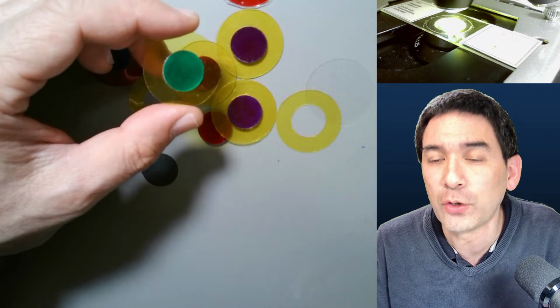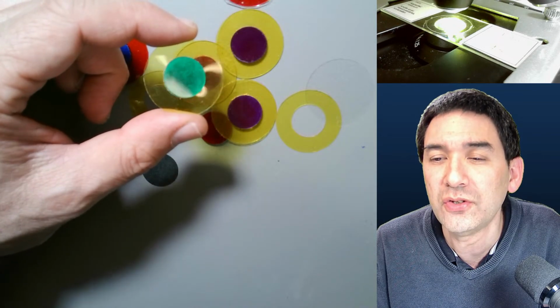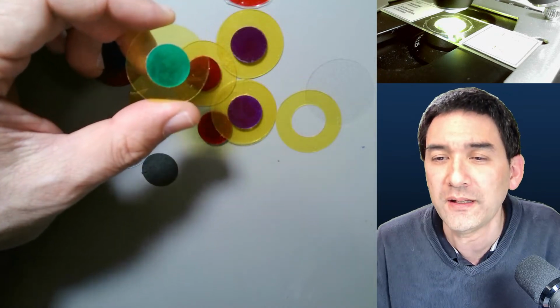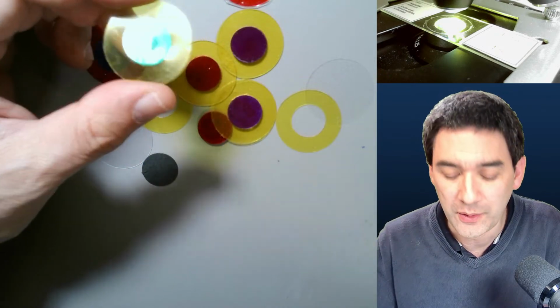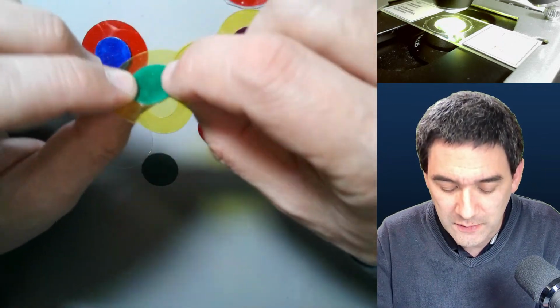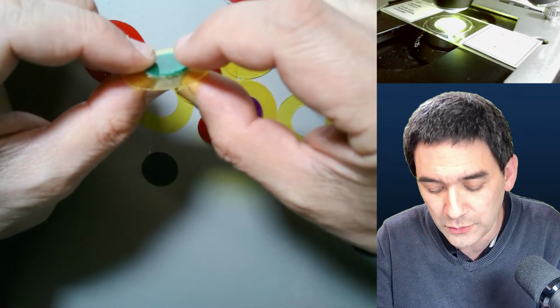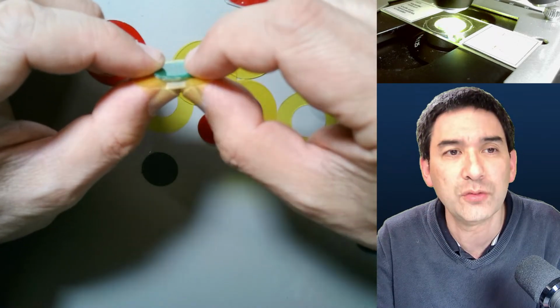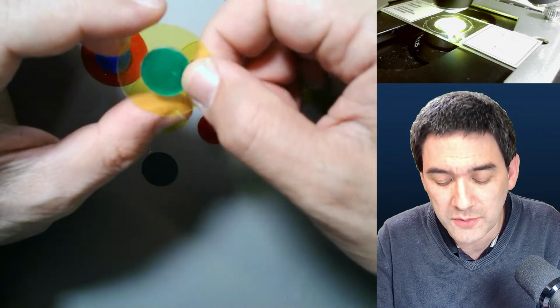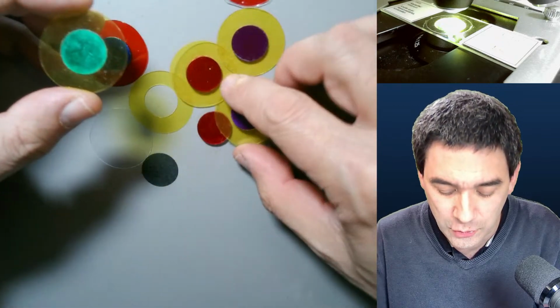So there is also a comment here. I bought some nice Rheinberg filters on eBay, but they were a little thick to use to fill into my filter holder, I need to make my own with thick acetate. So I wanted to just also show you now a little bit of another thing here. Those filters here, they have a fairly, I want to say maybe 1 or 2 millimeter thick central plastic disc. So when I put them in, what I do is I always put it in with the thick side pointing downwards so that I can actually swing it into position, right?